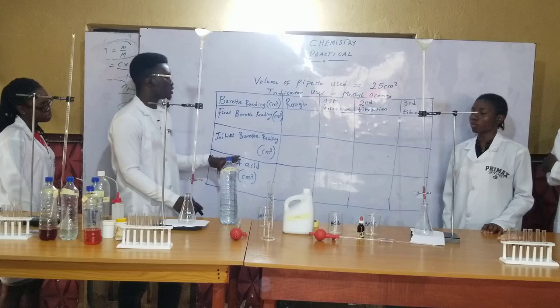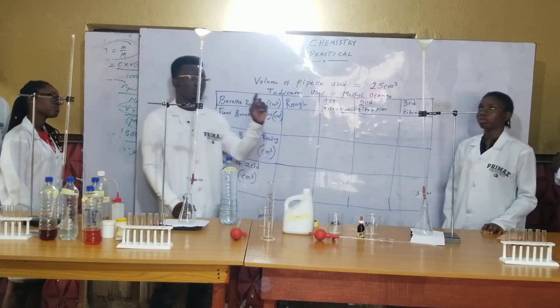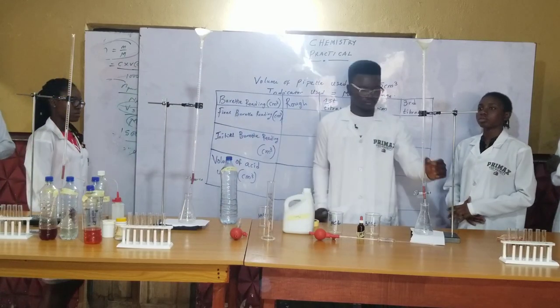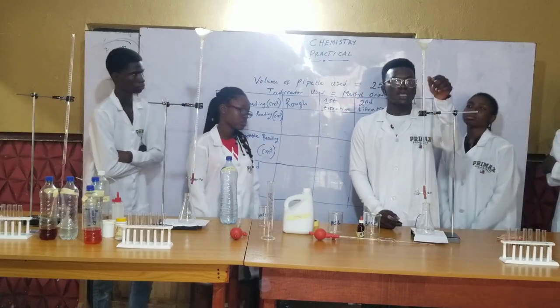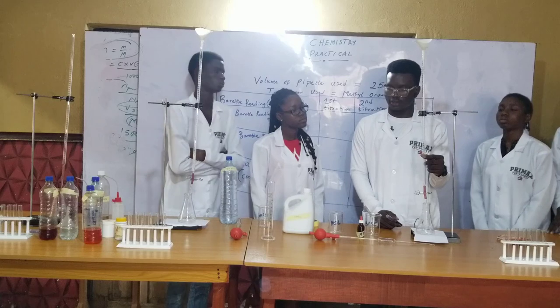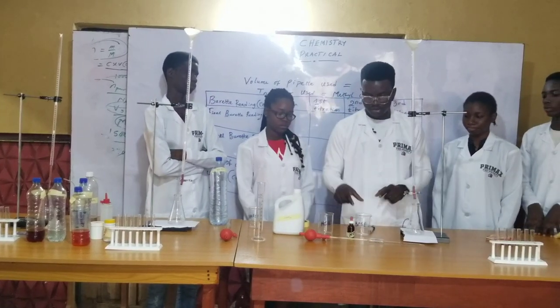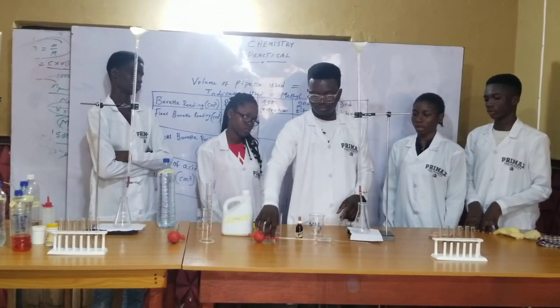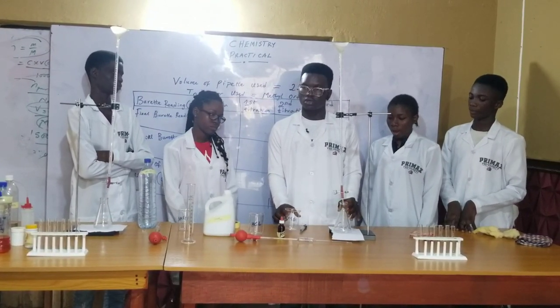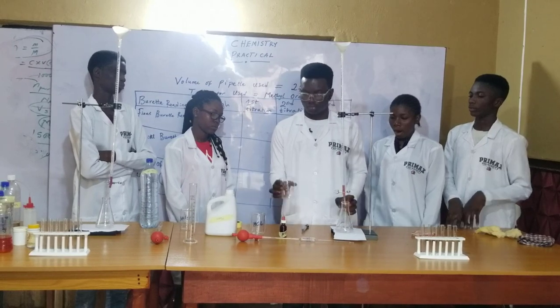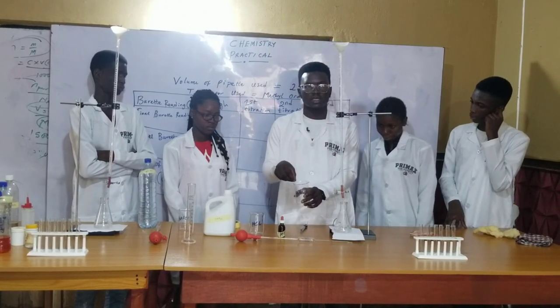The first thing for the rough: we are going to fill the burette. We fill the acid into the burette. Then we pipette the base — 25 ml of the base — into the conical flask. We first pour the base into the beaker so that we can easily take 25 ml.